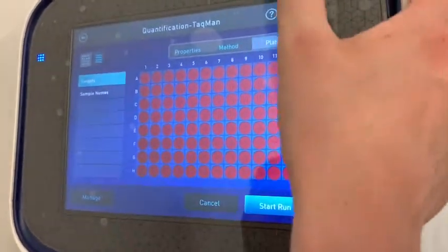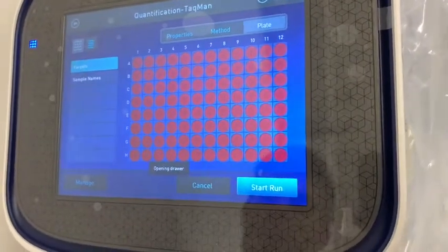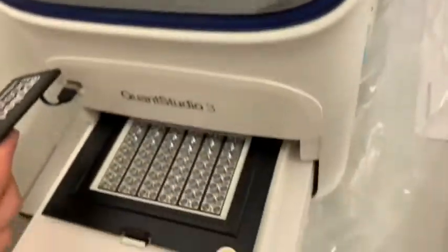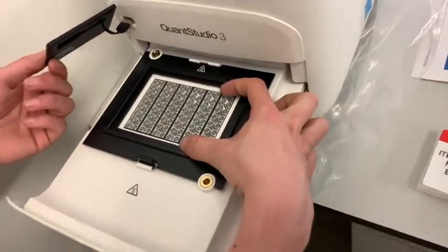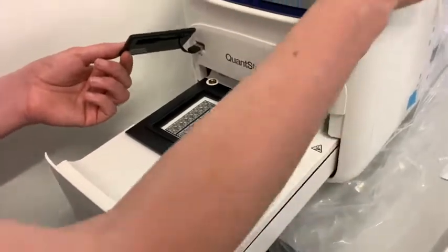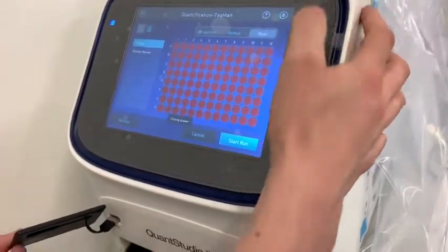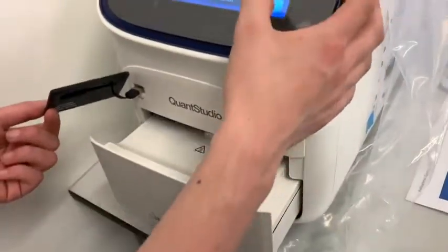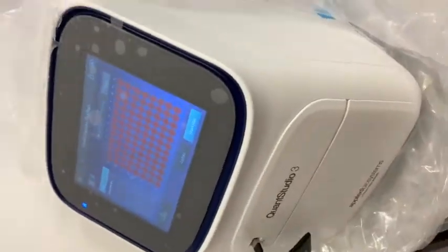Click on the eject button and it will open the plate cabinet. Place your 384 or 96 well plates, then close it by clicking on the eject button. Finally, click Run and the run time will start.